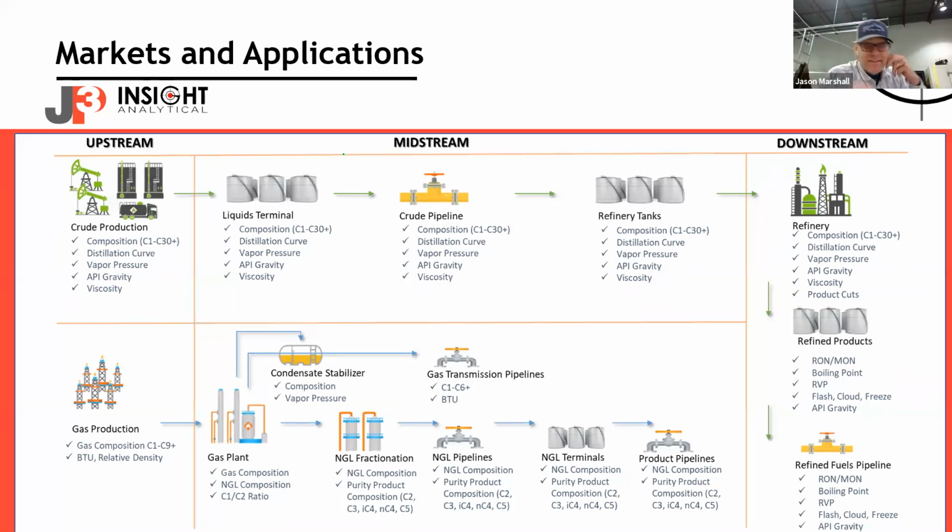Coming. Yeah, thanks. So yes, it is suitable for sour gas: all stainless steel construction, sapphire windows. I didn't go into that, but I did talk about the flow cell a lot more in a previous presentation, which we have a link to up on YouTube as well. It is 316 stainless steel, which is a NACE compliant material, with synthetic sapphire for the windows, not corroded by H2S at all. So certainly suitable for sour service.